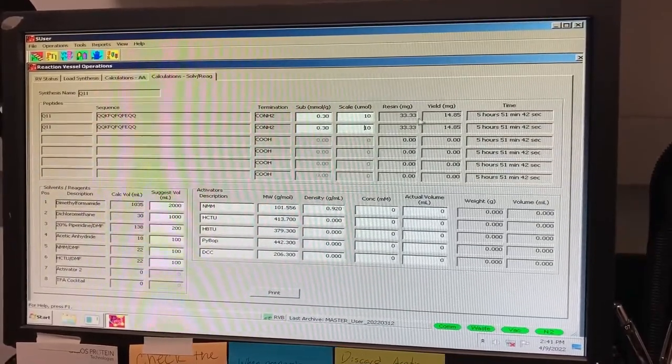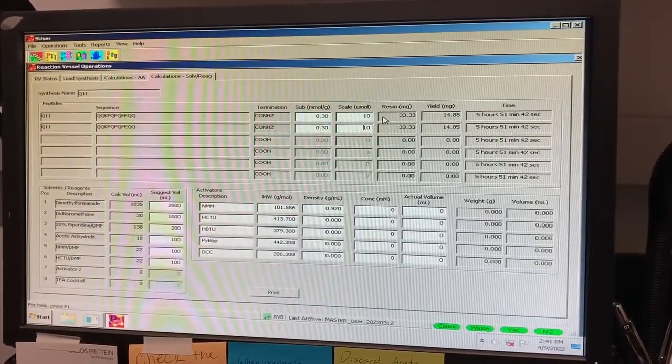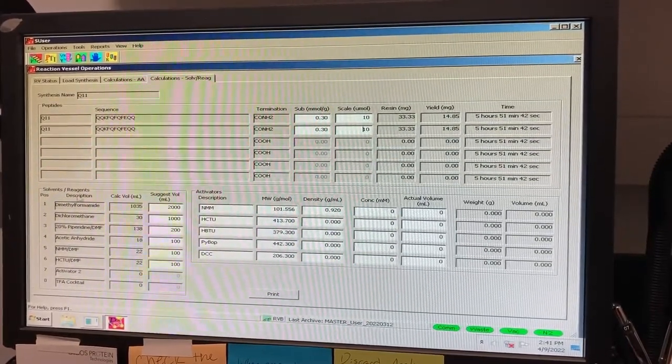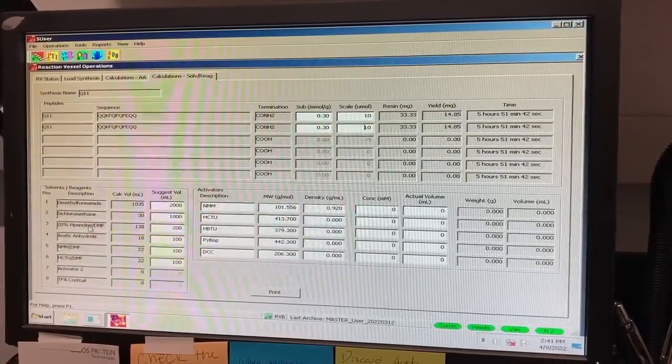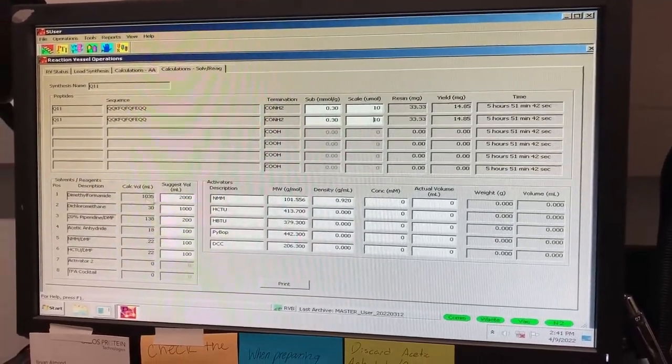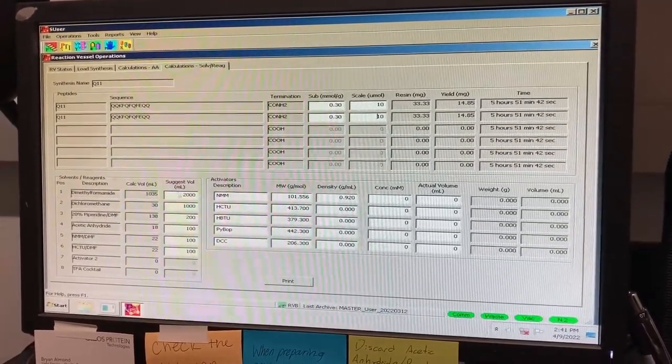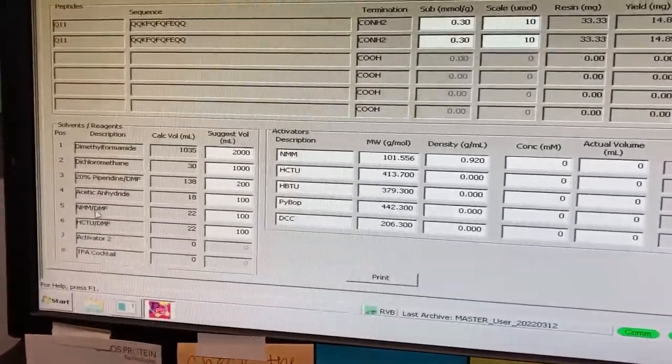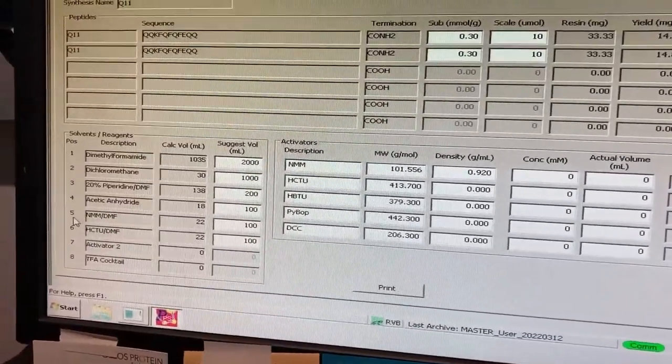On this page, in the bottom left corner, you will see the reagents and solvents needed for the synthesis. These also correspond to a number that can be found on the lines leading to the reagent bottles.